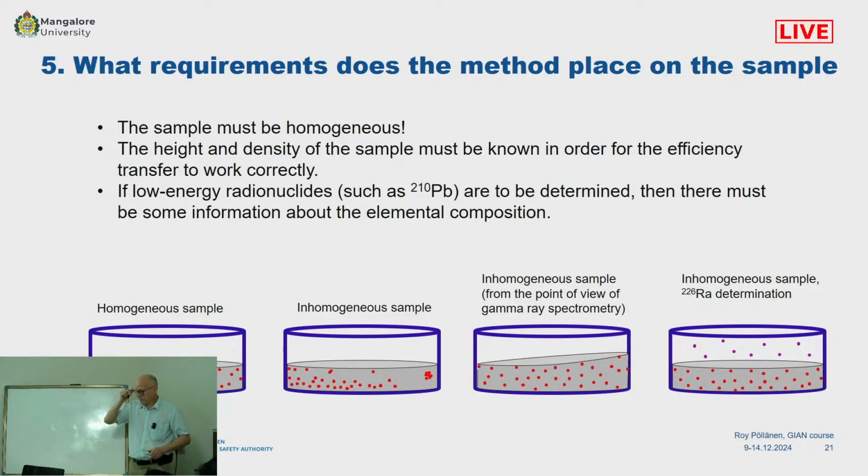In the beginning, when I came to the STUK gamma ray lab, we had more or less the same kind of system as you have. We have 18 detectors. Each of the detectors, if it would be the same case as you have, 16 calibrations.